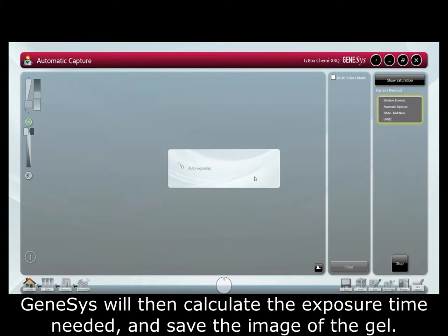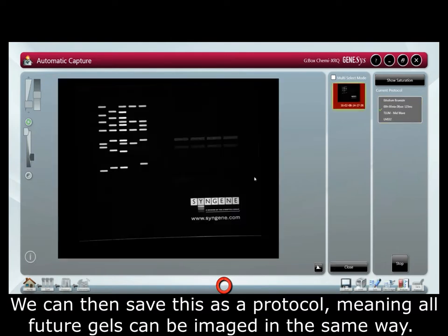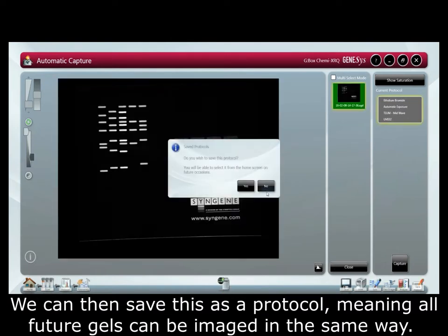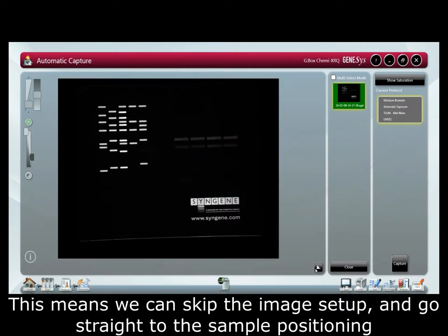Genesis will then calculate the exposure time needed and save the image of the gel. This will never saturate in automatic capture. We can then save this as a protocol meaning all future gels can be imaged in the same way. This means we can skip the image setup and go straight to the sample positioning.